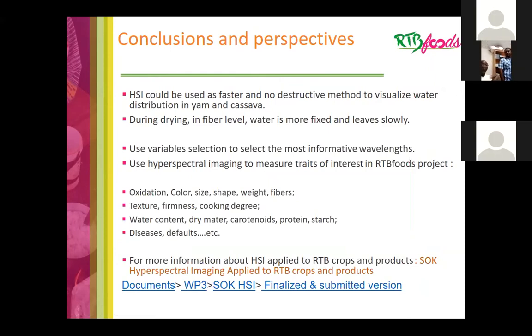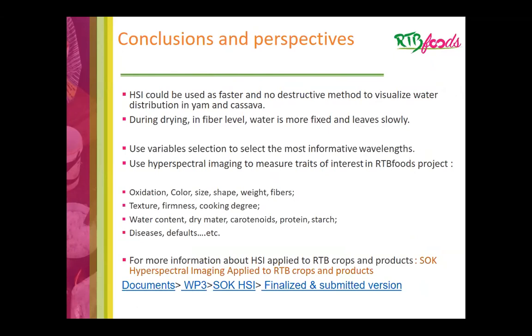During drying, we have also seen that at the fiber level, water is more fixed and leaves slowly. For perspective, we will use variable selection to select the most informative wavelengths and reduce the big size of hyperspectral data.